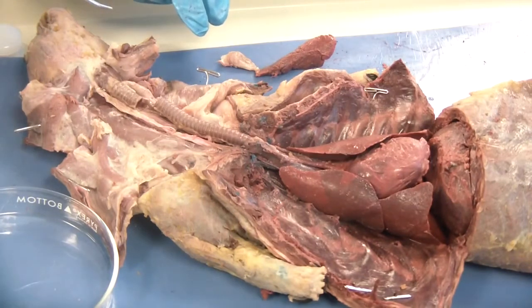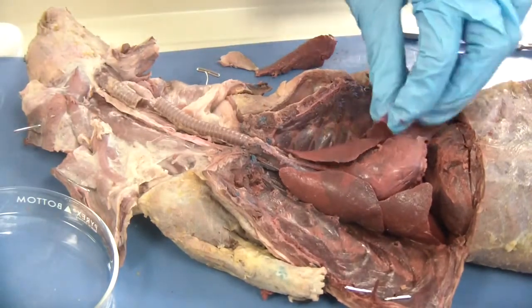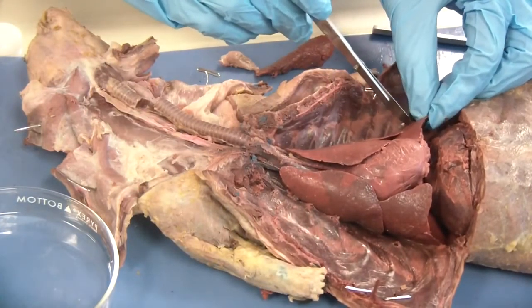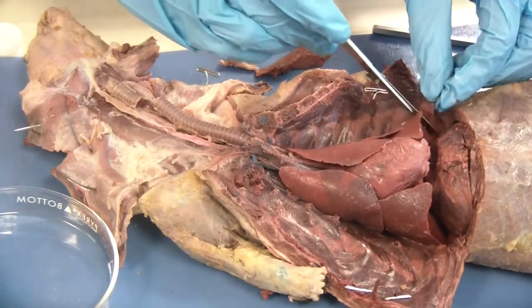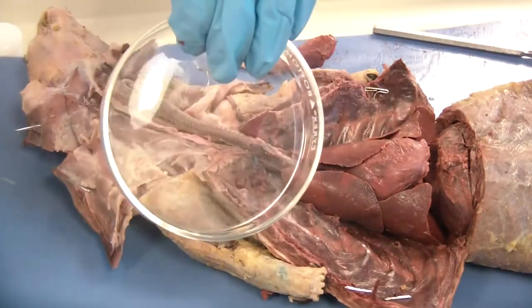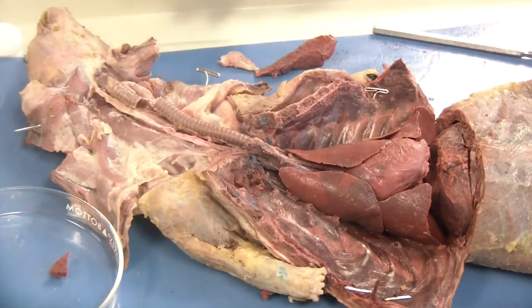Number seven asks us to use a scalpel to make a 0.5 cm cross section of one of the lobes. When you do this, you are going to be exceptionally careful — scalpels are very sharp, more sharp than the scissors. You are going to make a very thin cross section with your sharp scalpel and place that into a petri dish to look at under the dissecting microscope. There is your little cross section — you don't need much. The amount I have there is enough for us to look at under the microscope. We will take a look at that under the dissecting scope and record your observations.